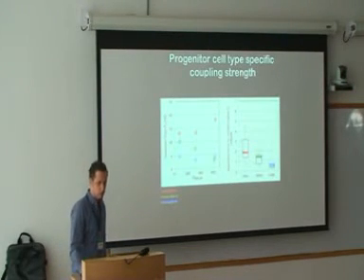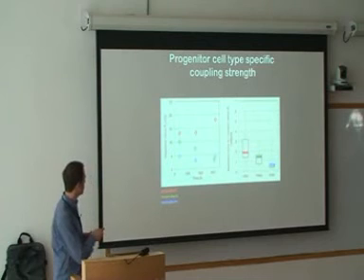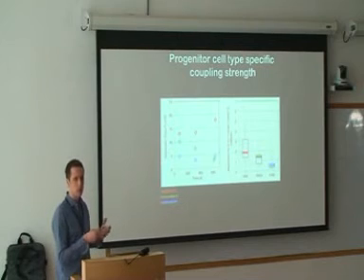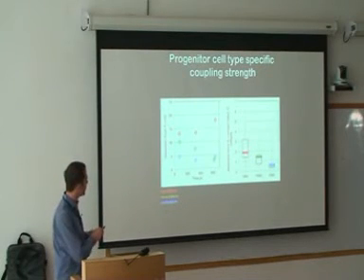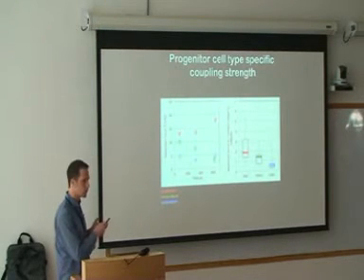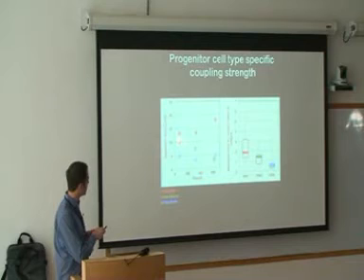Okay, so we have done these experiments for ectoderm doublets, mesoderm doublets and endoderm doublets. This is the contact time ranging from 1 minute, 5 minutes, 10 minutes. And this is the separation force we have determined when we pull these cells apart, which should be somehow a readout or a proxy or an indication for the mechanical coupling function of adhesion. What you see is that ectoderm cells at varying contact times from 1 up to 10 minutes have a consistently and significantly higher de-adhesion force required to separate these doublets than homotypic mesoderm doublets and homotypic endoderm doublets.